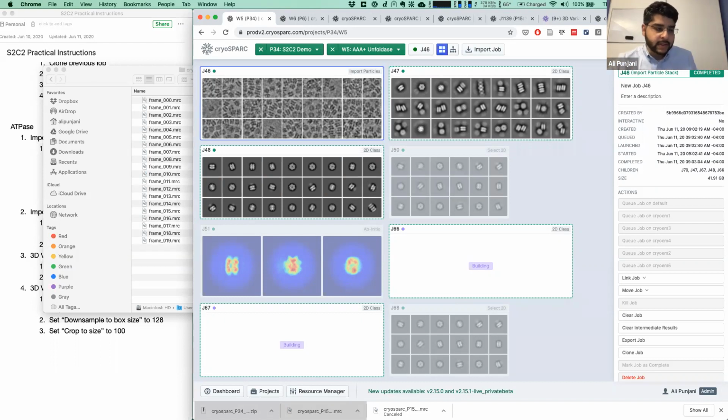They are present in the images, but when we do 3D reconstructions, the signal anywhere in the image that is far enough away, I mean, if it's very tight crowding like in this example, it theoretically does have an impact. Not that there's anything we can do about it because the sample is already frozen. But the particles that are far away contribute in the 3D structure to density that's outside of the main internal first particle, and all of that density gets masked out during a refinement.